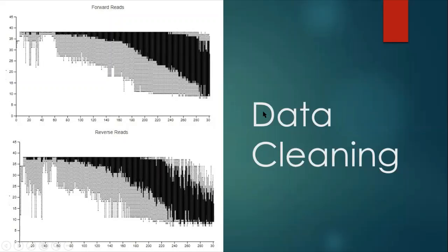That is the bottom graph. That is because DNA can be read both forwards and backwards. Now, if we take a look firstly at the forward read, well, first off, let me explain what the graph is.